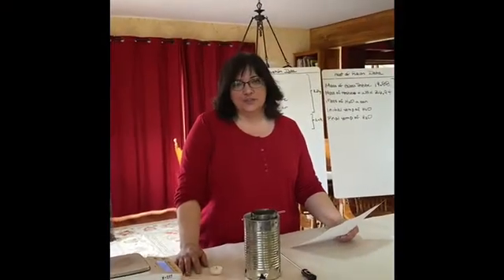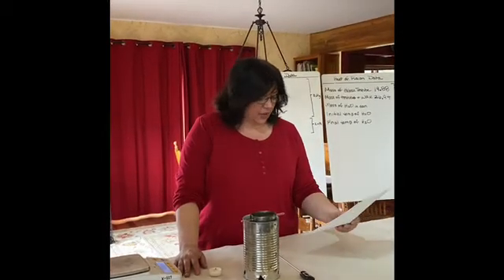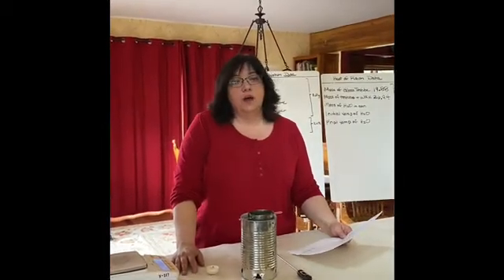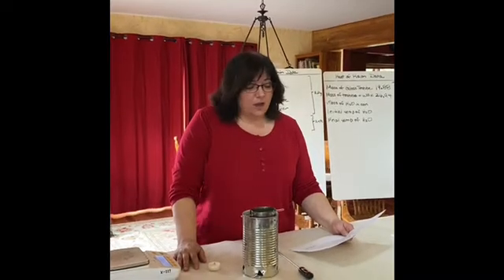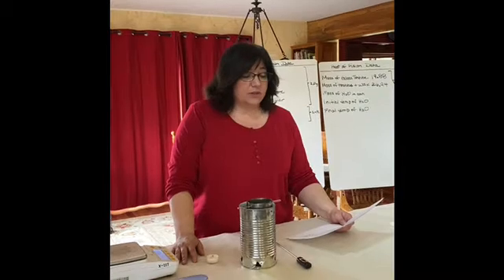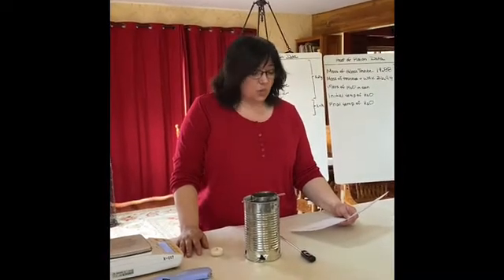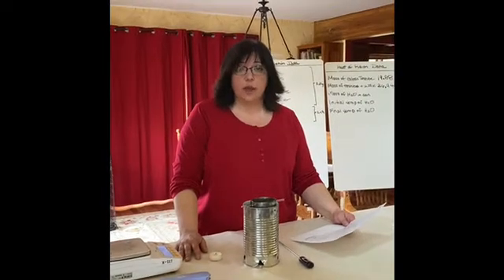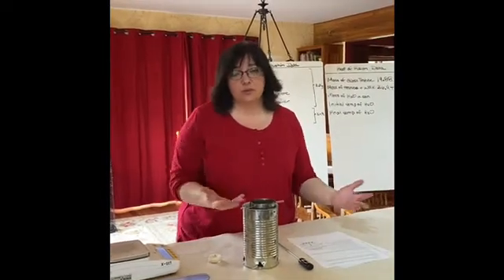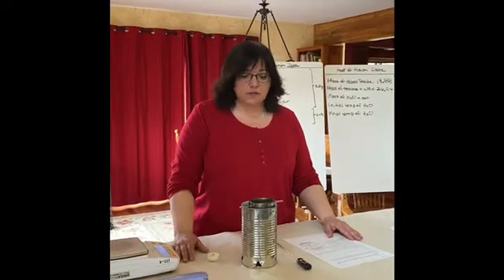Hello, chemistry students. Today we're going to take a look at the lab that is on page 851 of your honors binder. If you're in standard, I don't know what page you are on, but it's called Comparing the Heat of Combustion with the Heat of Fusion. So what we're going to do is use candle wax for both of them. Obviously we want to use the same chemical so that you can compare the two processes.